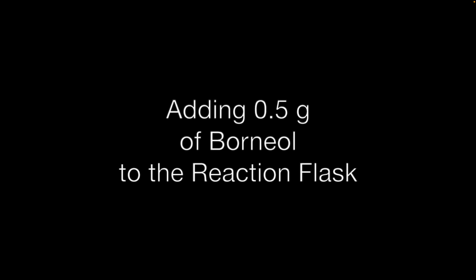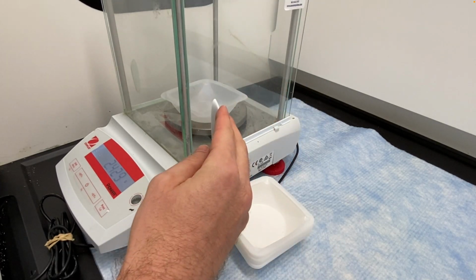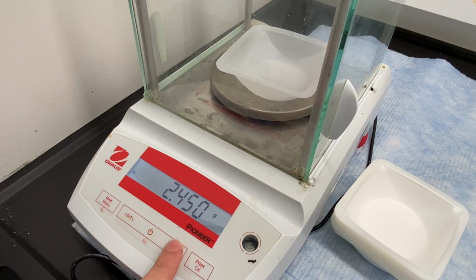So the first thing we need is our first reagent, the molecule that we're going to oxidize, and that is Borneol. So we're going to add 0.5 grams, or half of a gram of that. When you weigh something out, you'll first put a weighing boat on the balance. Make sure that the doors or the windows of the balance are closed, because the currents of air can change, and the balance is sensitive enough where the mass will change as different currents of air brush over the balance. So make sure you close those windows to get an accurate reading.